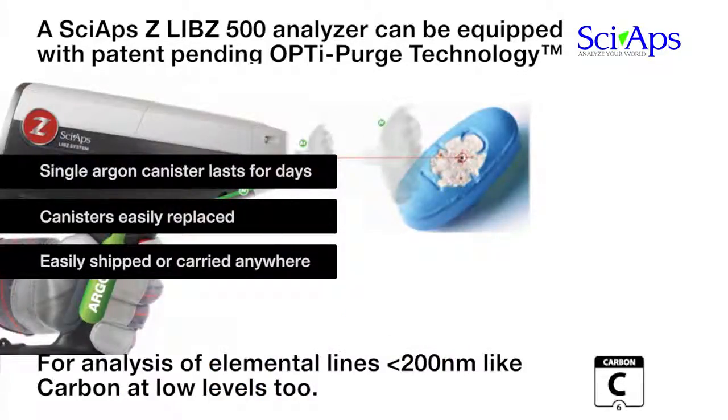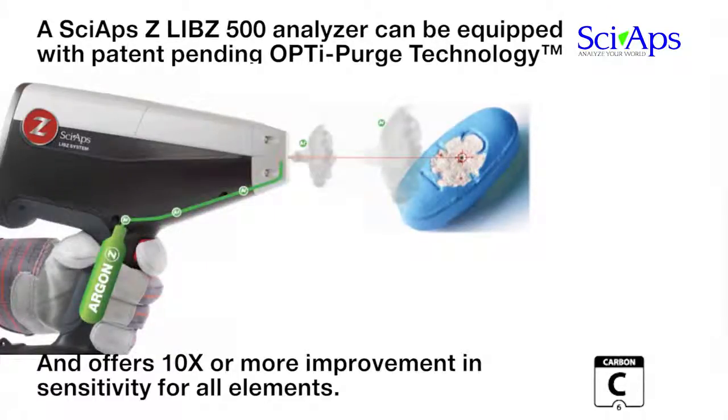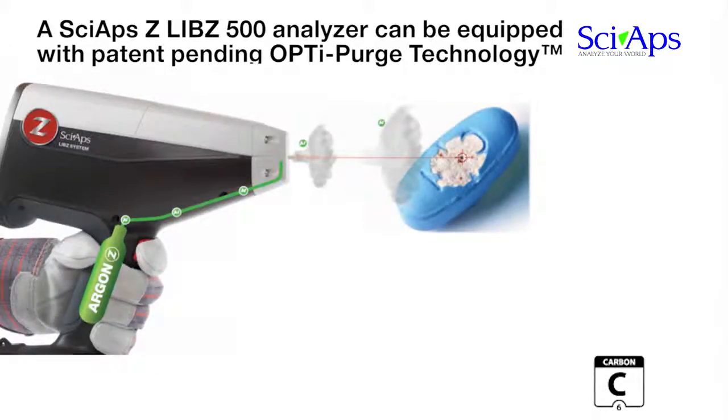OptiPurge is synchronized with precise gating and a pulsed laser to create an argon environment around the plasma. It uses microliters of argon to produce an effective purge during analysis. The result is vastly improved signal strength, particularly in the deep UV portion of the spectrum. The use of argon improves signal strength by 10 times or more for all elements.